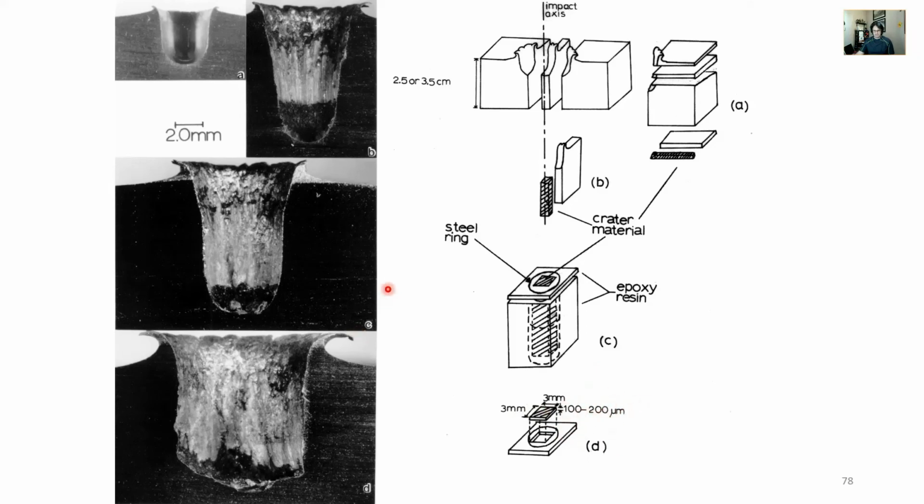I think that's close to correct. Maybe not. Oh yeah, because I polish it down further. Yeah, because we use a jet polisher, and you'll see in some of the supplementary documents. So there's ion milling, jet polishing, and I was going to share with you, I do microtomy.